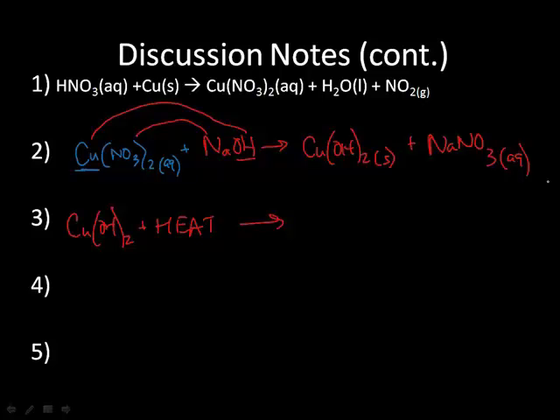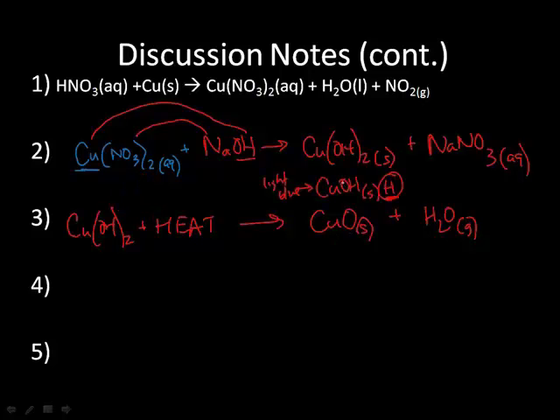Now there's already water in solution, but as you continue to heat it, you start removing some water from the copper hydroxide, the Cu(OH)2. This is because the Cu(OH)2 has two O, two H. If you remove one water from that, you're left over with just CuO, and that's the compound, the CuO solid. The CuO solid is what normally occurs, because CuO solid is that brownish, blackish colored substance.